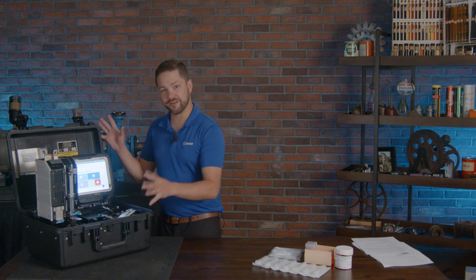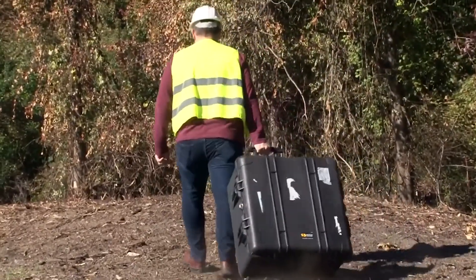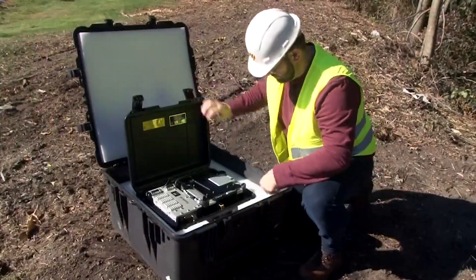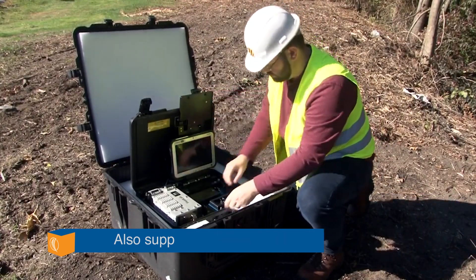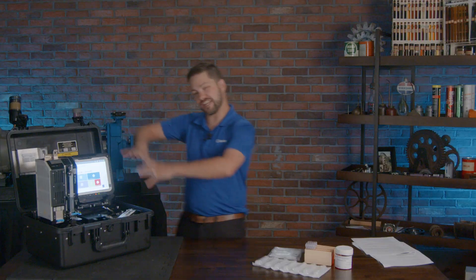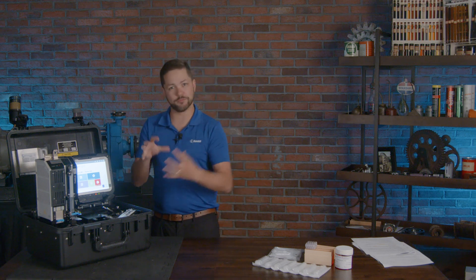The first thing I noticed is how well it's built — it's rugged. It's designed for environments like a mining environment, maybe an offshore rig, or power generation where there's a lot of contaminants, and where you're storing it could also be in a tougher environment. As we were opening it up and having things on display, it was very well built and held together very well.